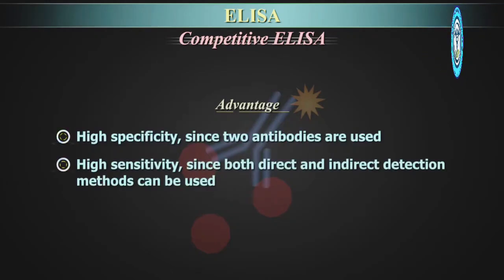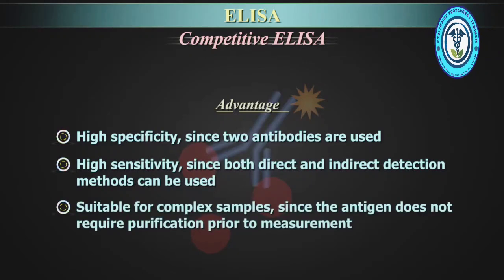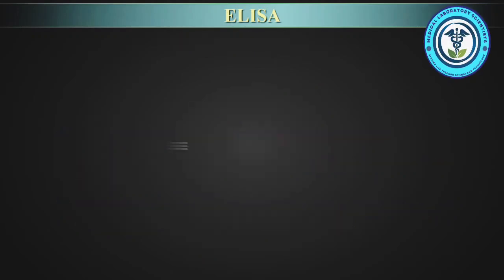High sensitivity, since both direct and indirect detection methods can be used. Suitable for complex samples, since the antigen does not require purification prior to measurement.